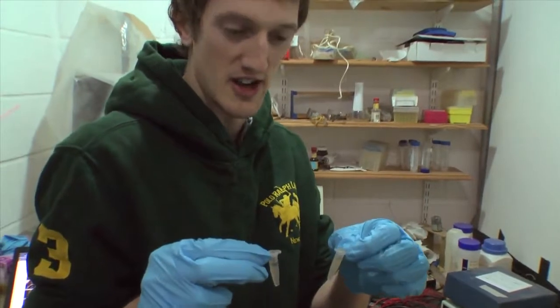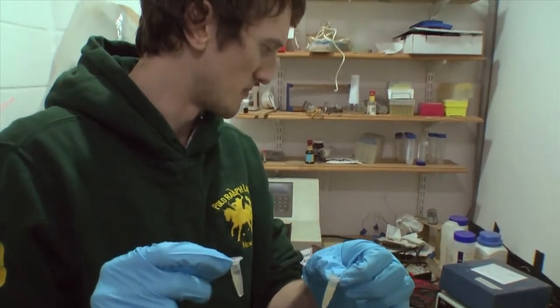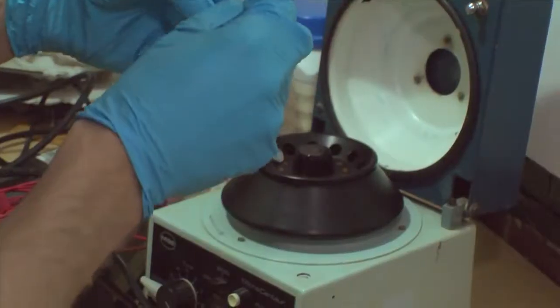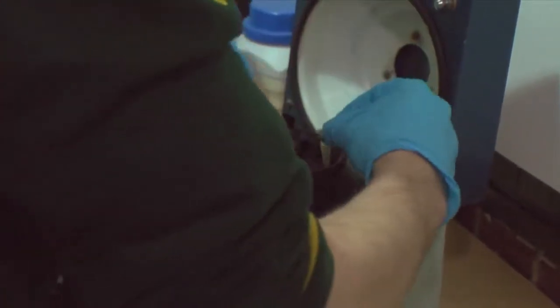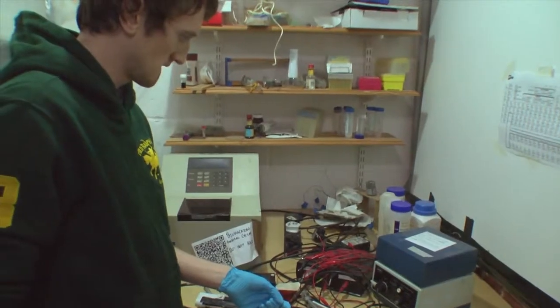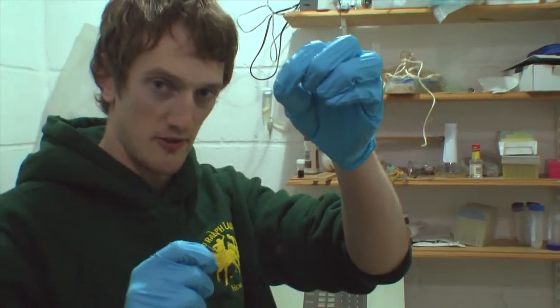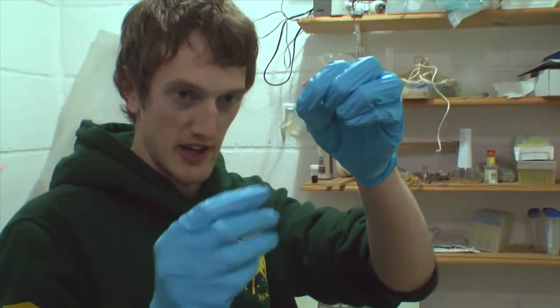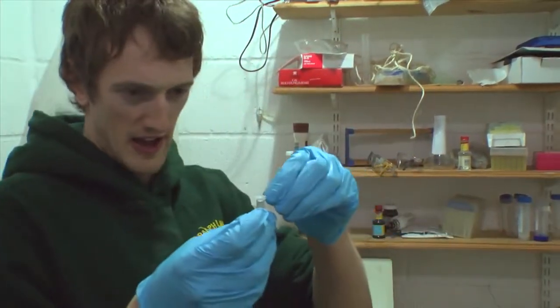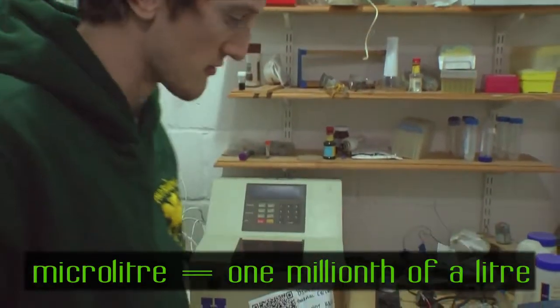So we're just going to put it in a centrifuge quickly to put all the solid at the bottom, leaving only the liquid at the top, and the liquid is what we want because the DNA is dissolved within it. The clear bit at the top is, hopefully, water with our DNA dissolved in it. We're now just going to take 200 microlitres of that water and keep it, and then throw the rest away.